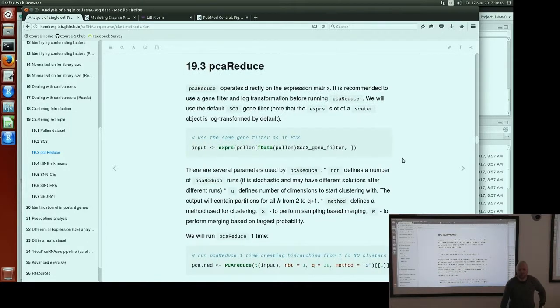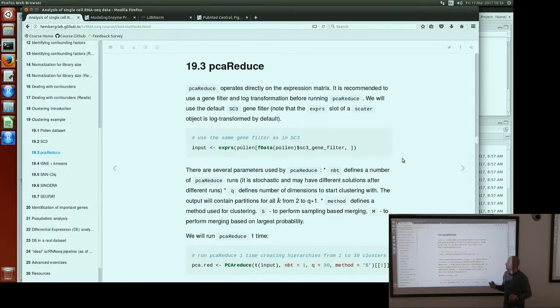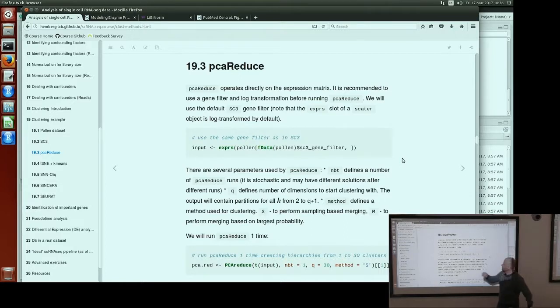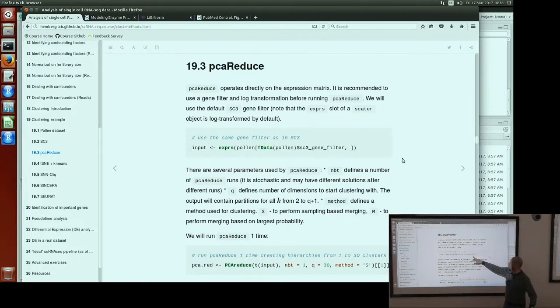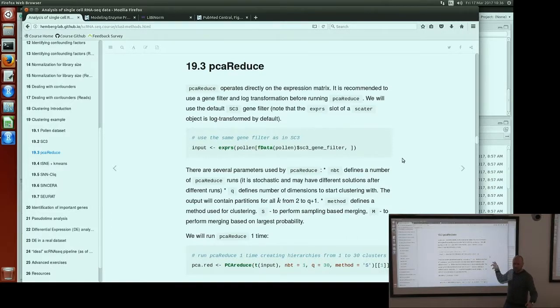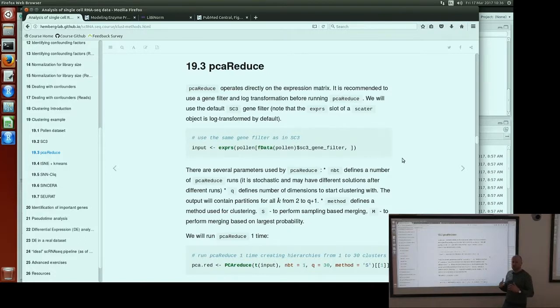The next tool is PCA-reduce. PCA-reduce is not integrated with SCATER, so we have to export the expression matrix from our SCATER object. We create a matrix object storing expression values from our pollen dataset. We use the SC3 gene filter here — SC3 internally has a gene filter to reduce dimensions. The default in SC3 is: if a gene is expressed in less than 10% of the cells it is removed, or if expressed in more than 90% of the cells it is also removed. This just makes your dataset a bit smaller. PCA-reduce also recommends using some gene filter to reduce dimensionality.